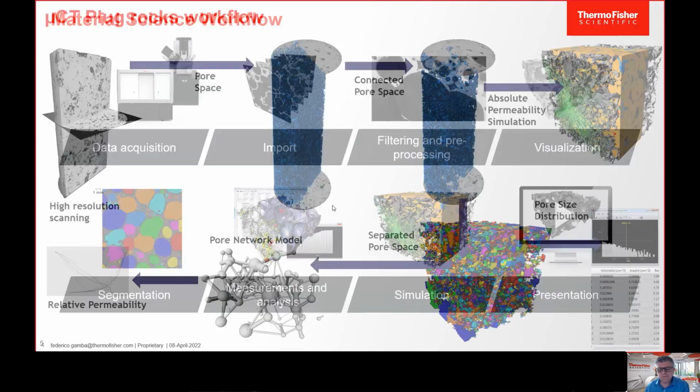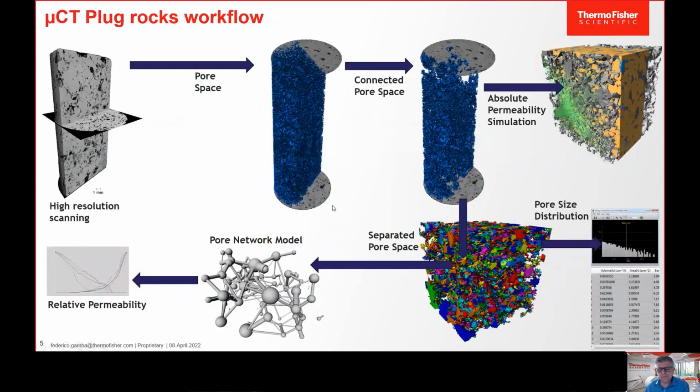In material science, if you go down to specifics, for example rock, and for example micro-CT, I focus on micro-CT because it makes sense. It's simpler, but we have workflows on full core CT, on micro-CT, on any scale, on SEM, on FIBSEM, on TEM. So I focus on this one because it's simpler for tutorials. But be aware, at the very end, I have one last slide in which I will show you other workflows.